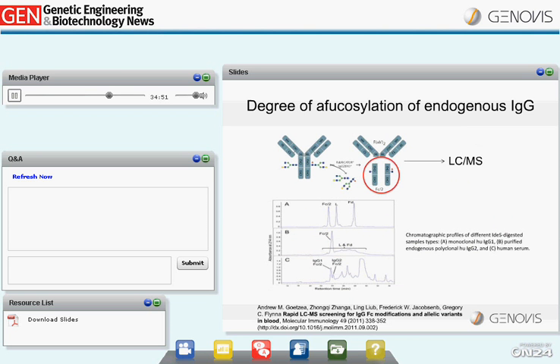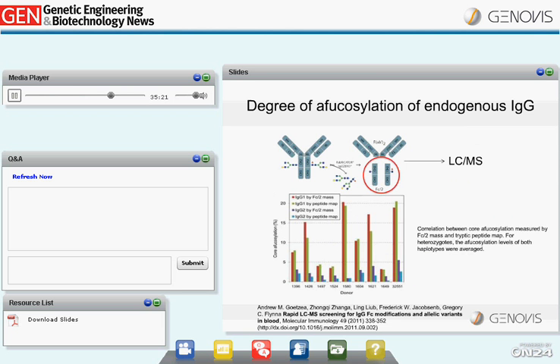Initially, they used a protein A purification step to isolate the Fc before doing LC-MS, and the corresponding chromatogram is shown in panel B. However, they later discovered that they could run the digested and deglycosylated sample directly on LC-MS without prior purification of single-chain Fcs and still readily detect the degree of fucosylation for both IgG1 and IgG2, and this is shown in panel C.